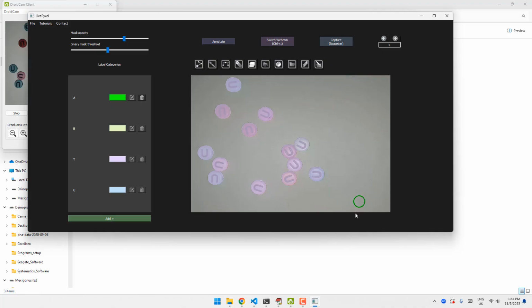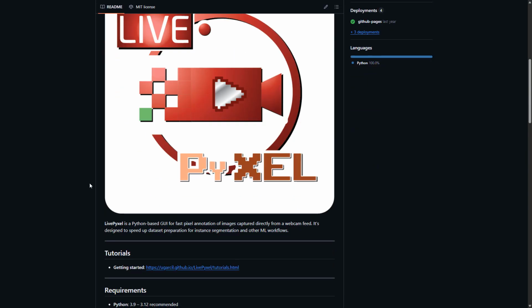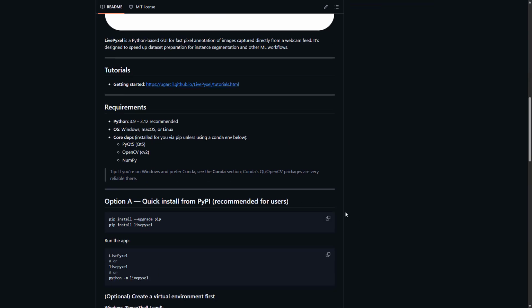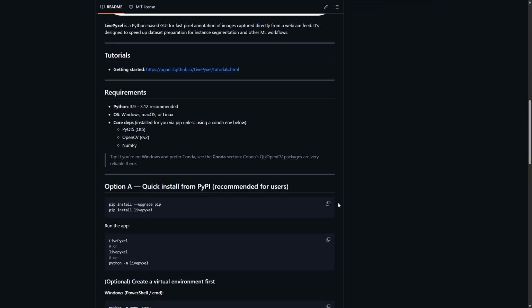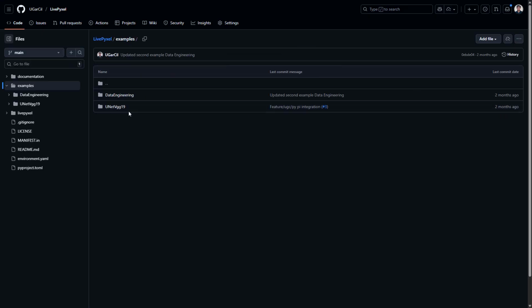If you have any questions or you have any comments or encounter any bugs, please let us know. You can access the GitHub repository, and I should take us there. On the GitHub page, you'll find the official documentation along with this and other tutorials in case you feel stuck in the installation process or need additional assistance or code for the next steps that follow the generation of the annotations. In the examples folder, we have two main folders.